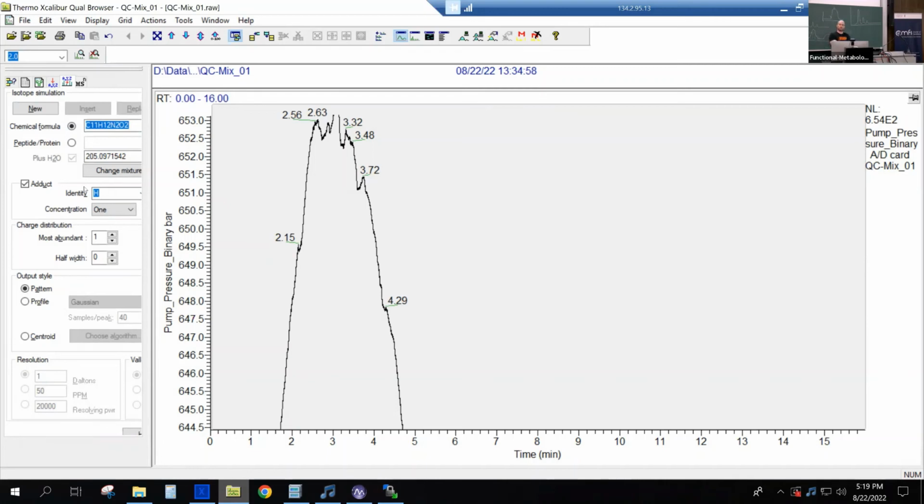I mean, we simply do it for economic reasons, right? Because changing the full columns, we use Phenomenex Kinetex, they're like $800 per column. We have very diverse samples in the lab, and sometimes people just bring something that has a lot of PEG or whatever, and then you ruin your column. It's better if you ruin only your pre-column. It has a cartridge holder and you can exchange it. So basically most of the columns we have have pre-columns.